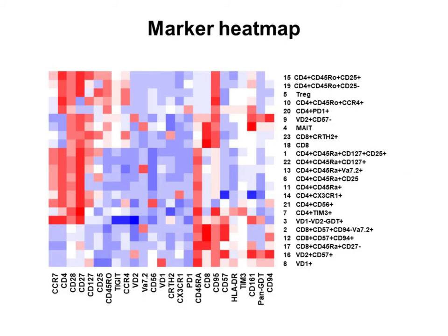And this is just to summarize, based on this trial experiment, the different populations we were able to identify using those additional markers. So really, it's to show you that we came up with a flexible core panel that enables it to fit various scenarios. We also have worked on a B and NK cell core panel.